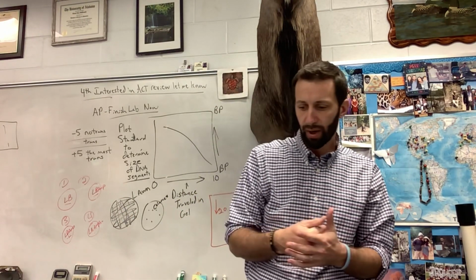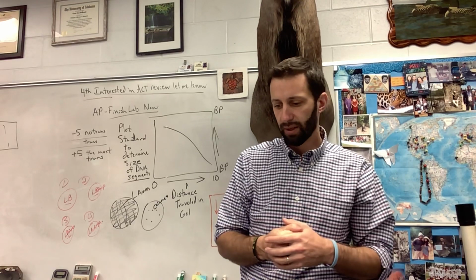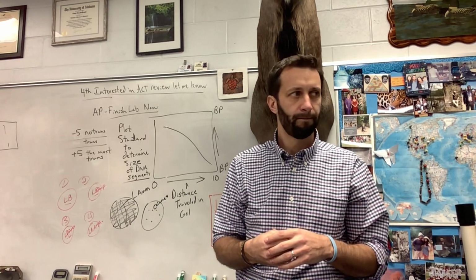So for instance, on that previous page, it's got DNA 2 and it's got DNA 1, okay? DNA 2, the first segment traveled 2 centimeters. Remember, move the decimal over. So it traveled 2 centimeters. So how are we gonna figure out how big that DNA is?